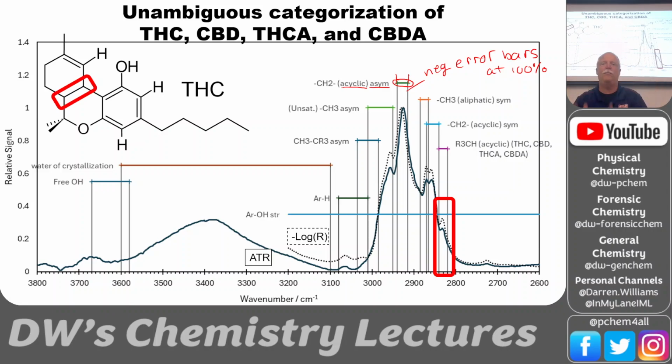And so that produces this little box that should contain a peak that is the CH2 asymmetric stretch. So this is the asymmetric stretch for the CH2s. Should appear in this region. And what do you know? Our peaks, we have very good peaks right there. That's the maximum peak in the CH stretch region because we have these CH2s right here. That's the CH2 stretch. We also have a couple over here. Okay. And then here's the CH2 symmetric stretch over here. So this is that blue region.